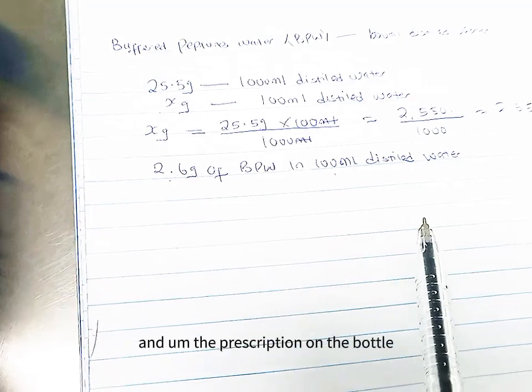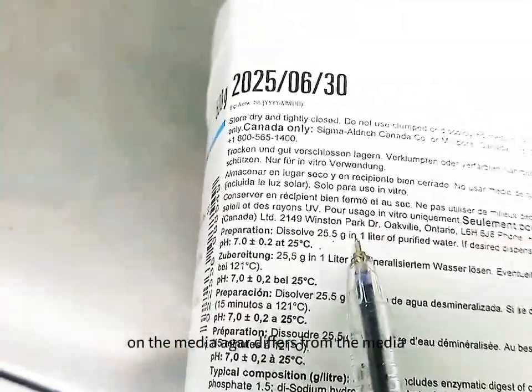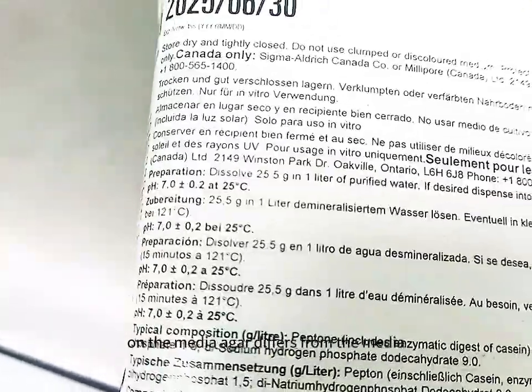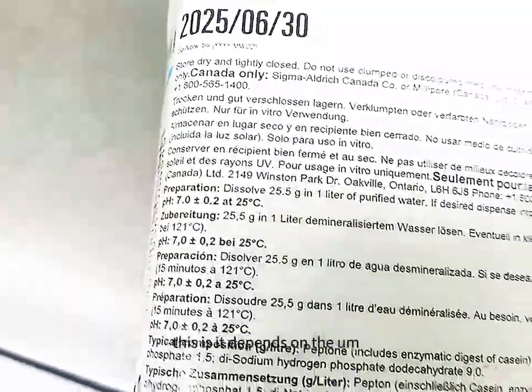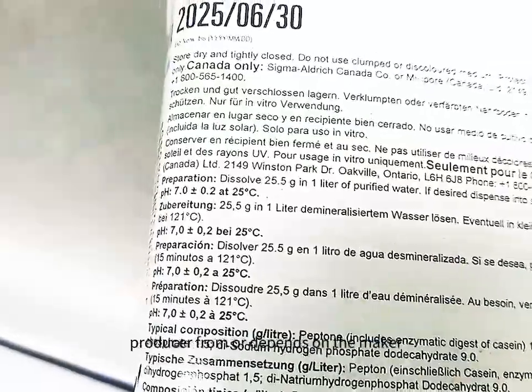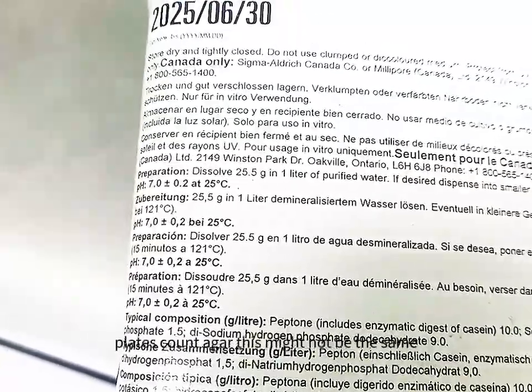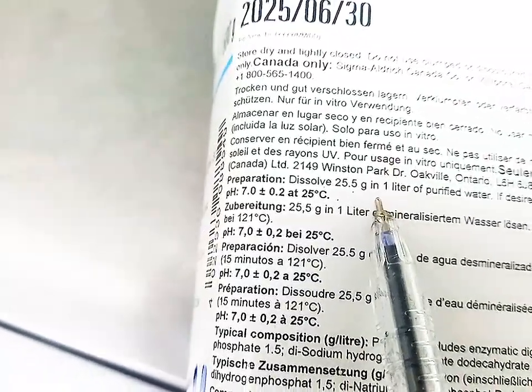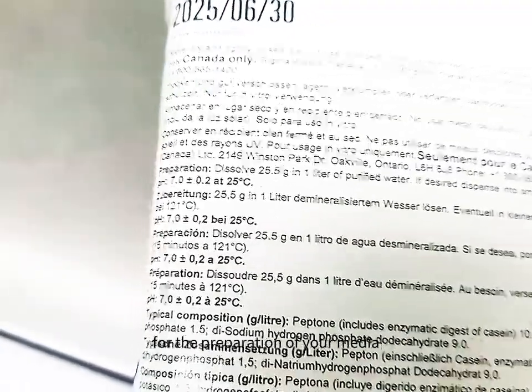And the prescription on the bottle, on the media agar, differs from media to media. If you are making use of buffer peptone water, this is it. It depends on the producer, depends on the maker. And if you are going to be making use of plate count agar, this might not be the same prescription that they are going to give you for the preparation of your media.